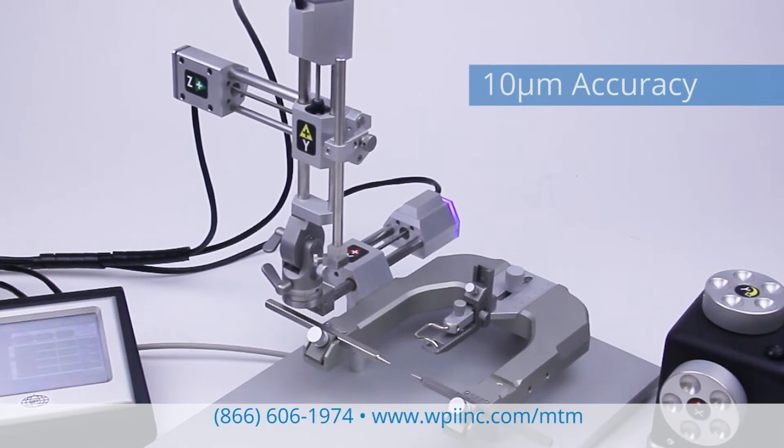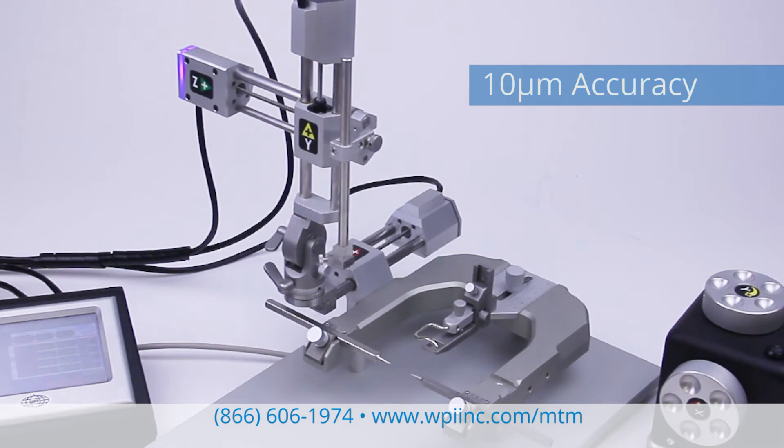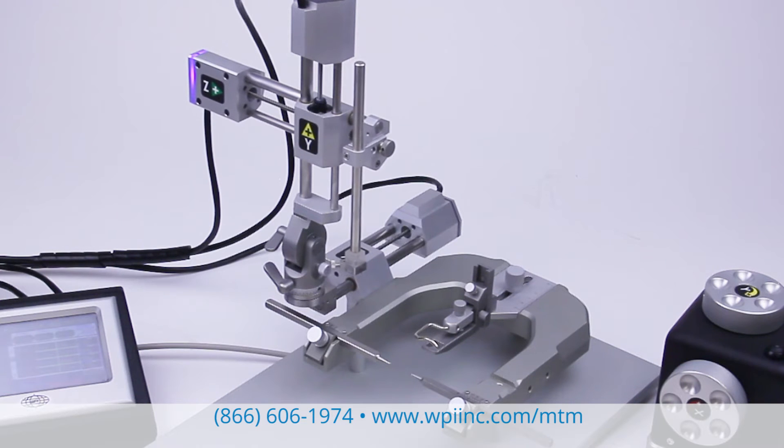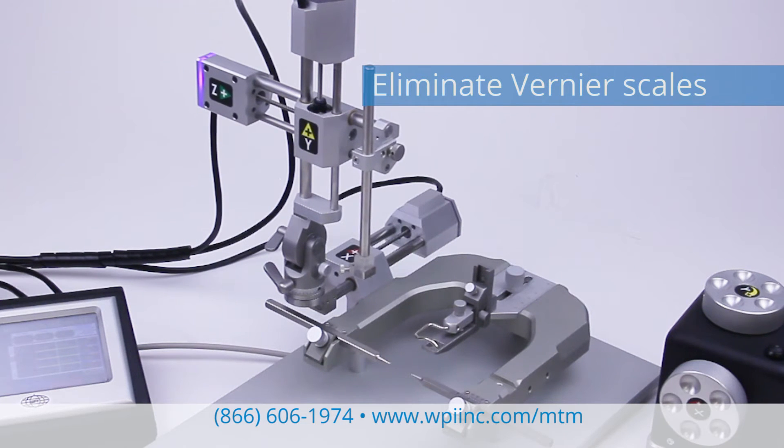High-resolution stepper motors ensure the accuracy of the MTM3, which delivers submicron stepping resolution. Vernier scale reading errors are eliminated.